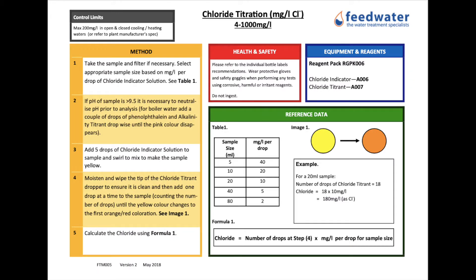Today we're going to demonstrate a field test method for measurement of chloride in water samples. This is a titration method and the reference code for this method sheet should you need to request it is FTM005.